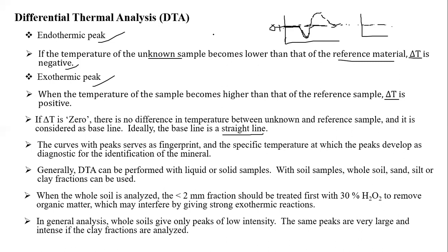Mostly these curvatures with peaks serve as a fingerprint. These graphs give us the specific temperature at which the peak develops, which is diagnostic for the identification of minerals. Generally, these graphs will give proper information. Generally, it is considered a fingerprint for the particular mineral.